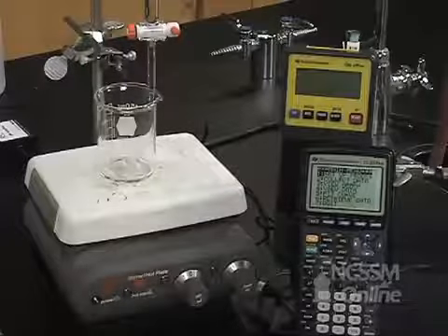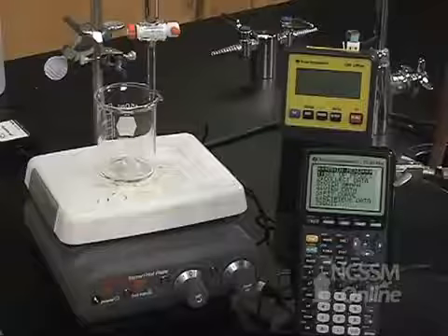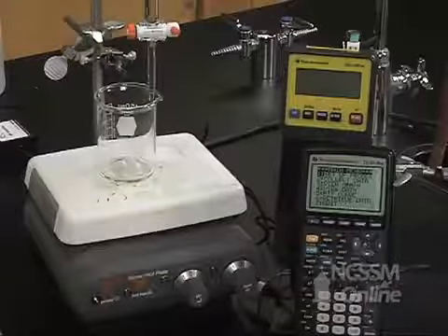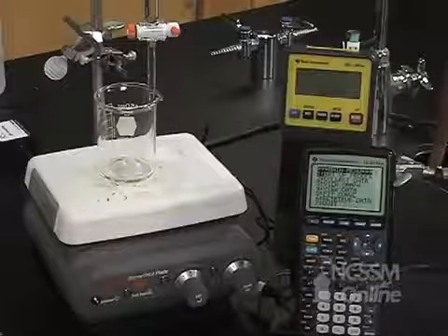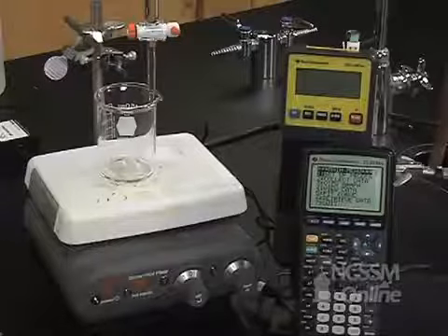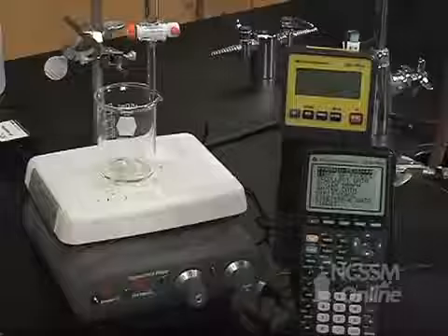We're going to do a series of titrations to generate titration curves for strong acid with strong base, weak acid with strong base, and weak base with strong acid.